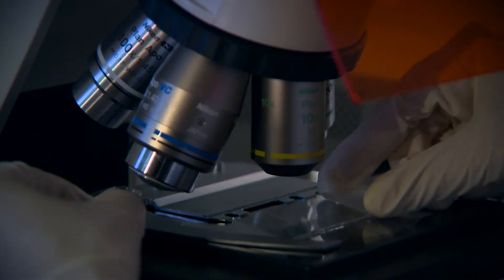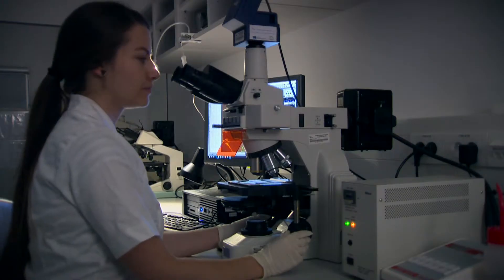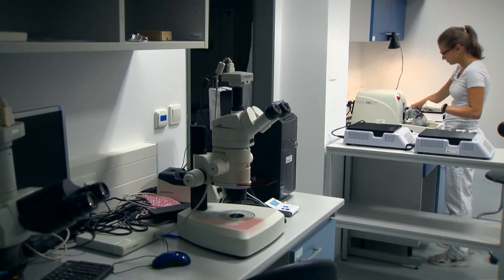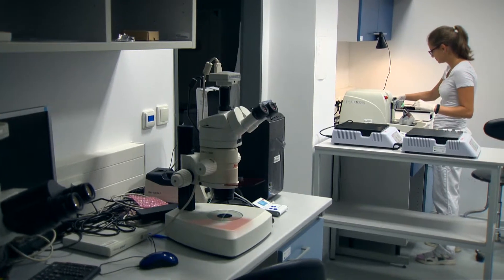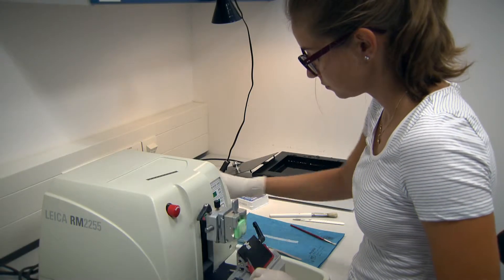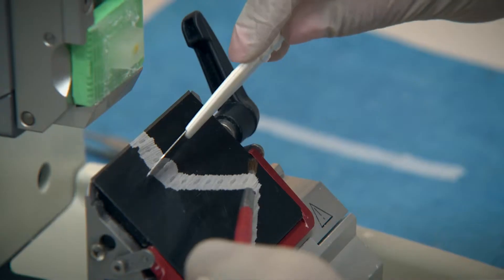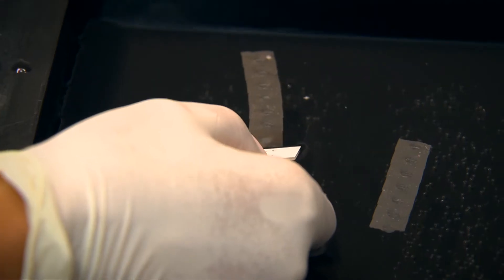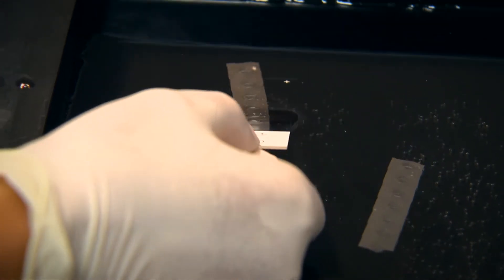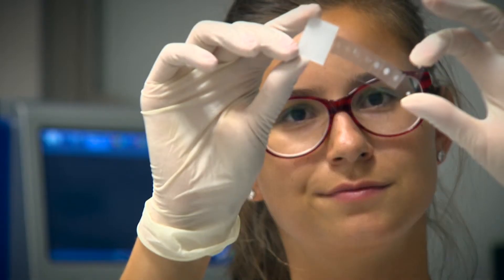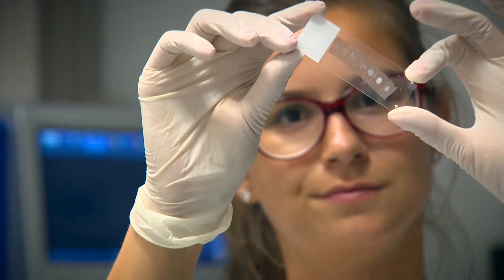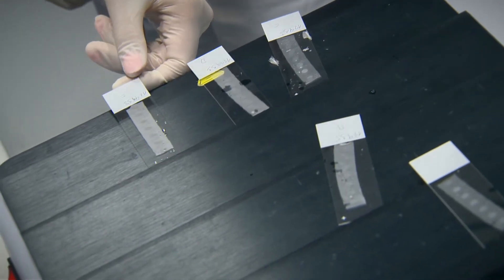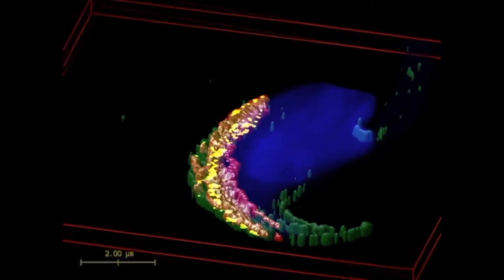Immunofluorescence methods are used to visualize the proteins present in sperm and egg, as well as to study their interaction and role during fertilization. Specialized fluorescent microscopes are used to capture photographs and videos.